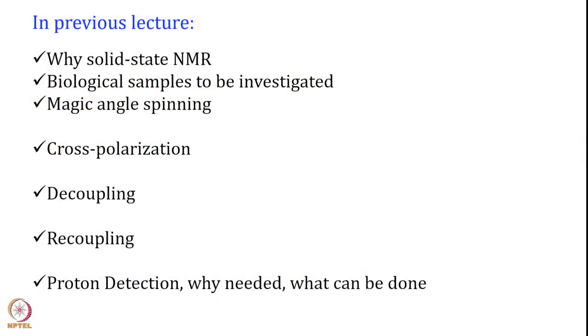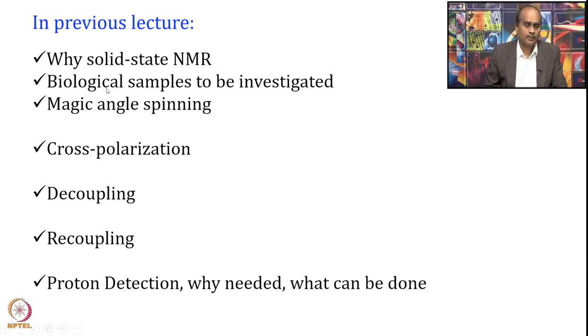Good morning. So we were discussing basics of solid state NMR spectroscopy and its application in structural biology. In the previous two lectures, we discussed why solid state NMR, and what kind of biological samples we can investigate: those that are not amenable to crystallography and are not soluble. For example, integral membrane proteins or amyloid fibrils. These difficult molecules cannot be crystallized, nor can they be dissolved in solution for liquid state NMR, so they are perfect samples for solid state NMR.